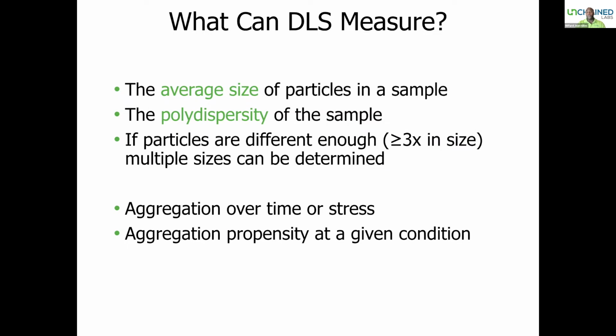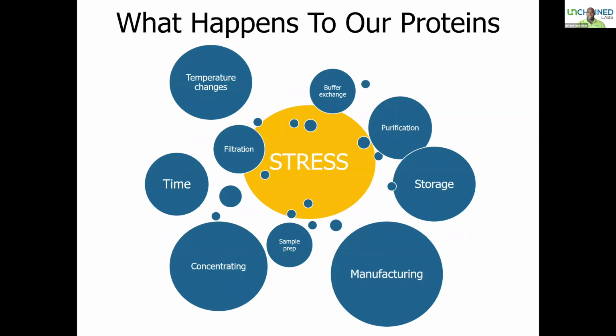And so if you want to look at the effect of aggregation over time, if you are stressing your samples, or if you are storing them, or if you are doing a lot of buffer exchanges, it's a very useful way of doing so. And so when you think about the different things that can happen to a protein, quite a lot can happen, right? They can be stressed in many ways.